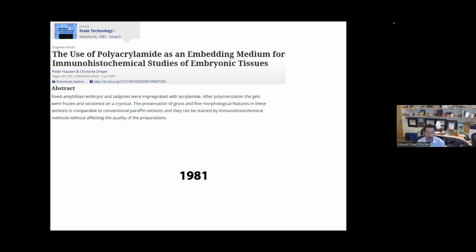So they used polyacrylamide. We're using the charged cousin, polyacrylate. But it's fun to think that if somebody put 2 and 2 together, the talk that I'm giving you today could have been given over 40 years ago.